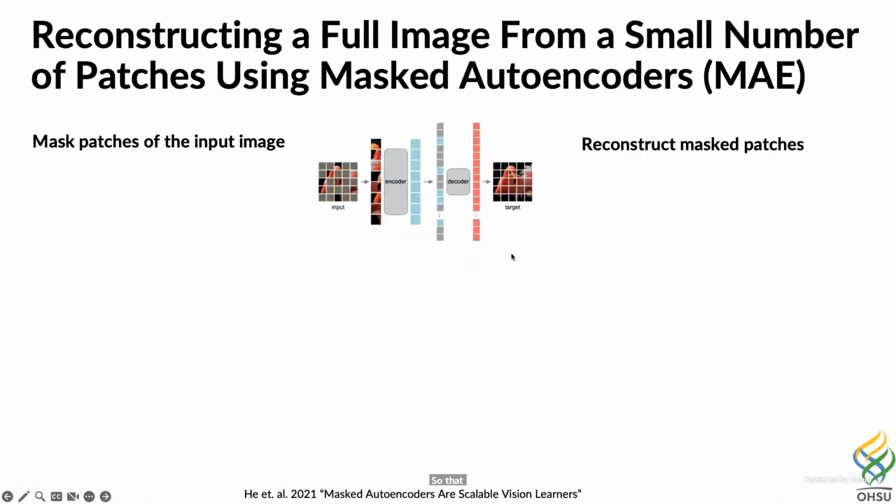So the framework through which we implement our panel reduction and marker imputation process is a clever implementation of the masked autoencoder. We've talked a lot over the past couple of days about masked language models, and the masked autoencoder is this extension of masked token prediction to images, where the two key differences are that we use an encoder-decoder framework where the encoder only sees the visible image patches, and the decoder then takes the latent representations of those visible patches along with the mask tokens, and uses them to regenerate the missing patches.